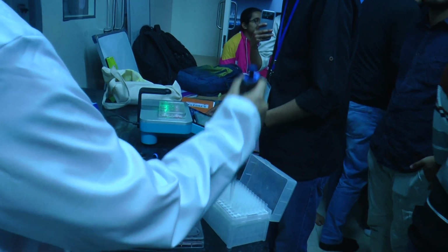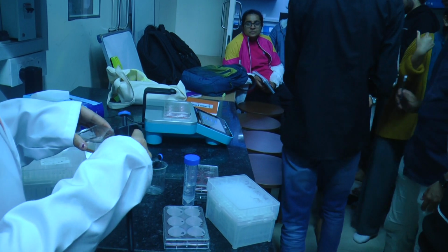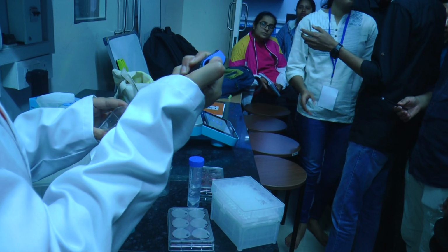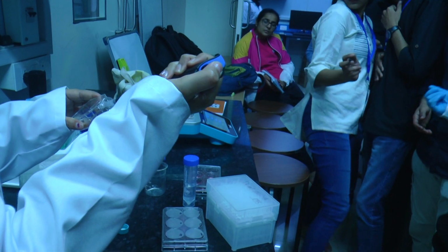So first, in these cells we have the culture media, okay? So first we'll remove that. We'll slowly remove it so that the pipette should not touch the bottom, because our cells are adhered there.